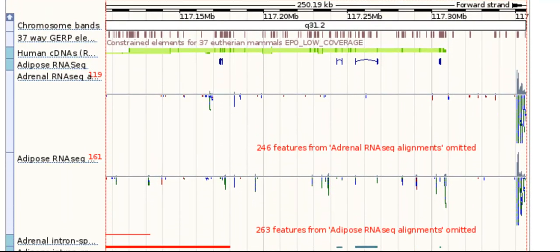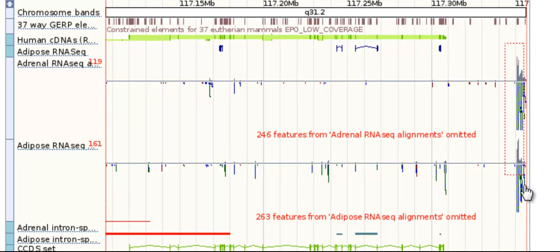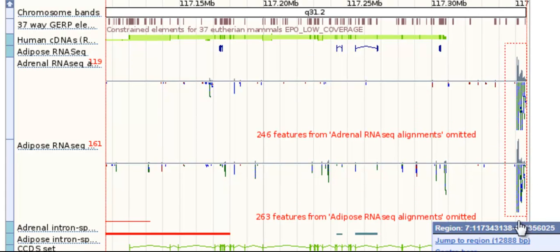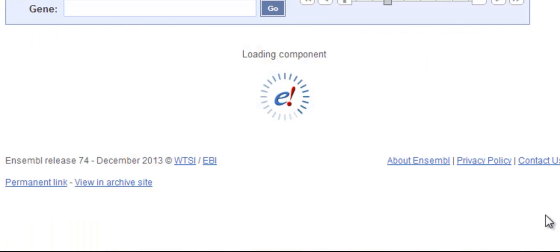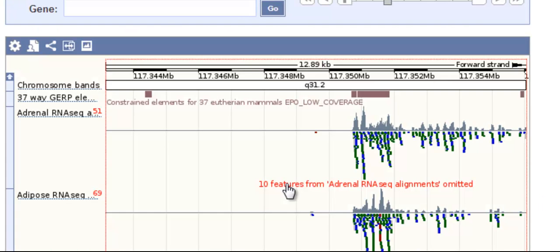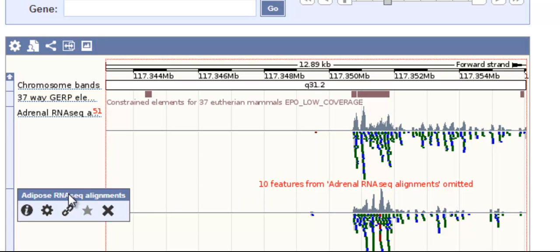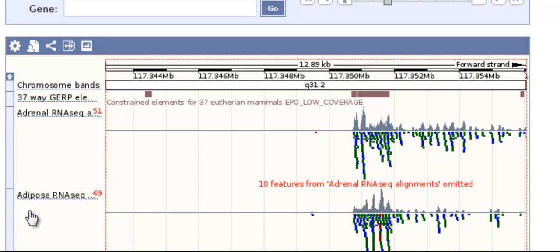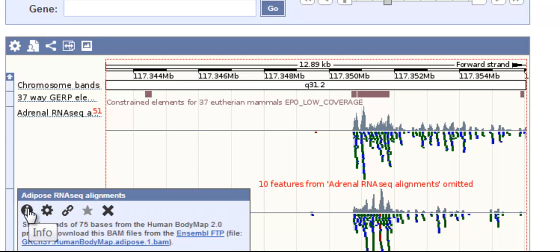Back in the region in detail view, I can see the adrenal and adipose RNA-seq alignments to the genome. I'll zoom in to this region by clicking and dragging with my mouse. Find information about the alignments by hovering over the track name, then the eye.